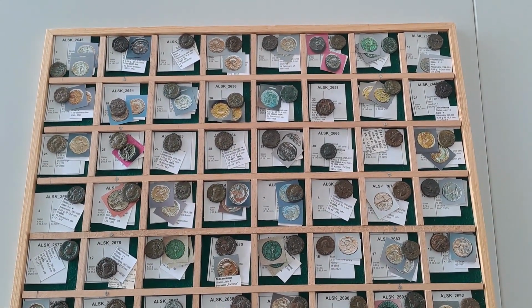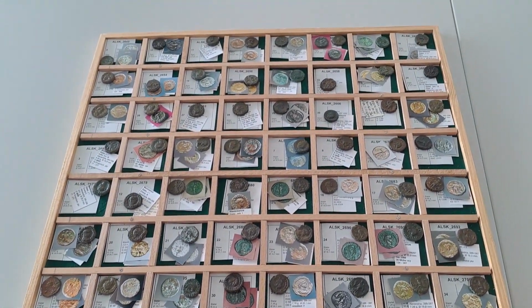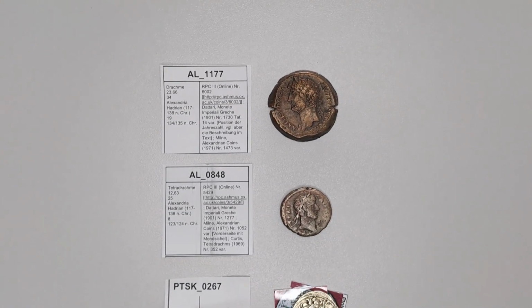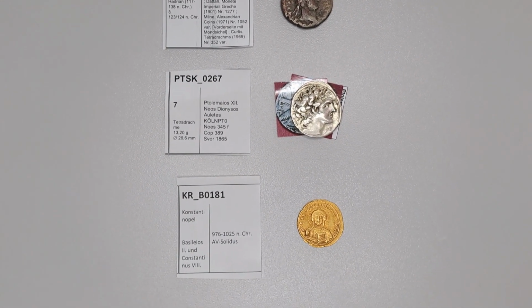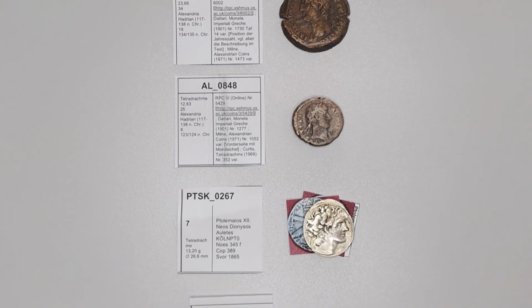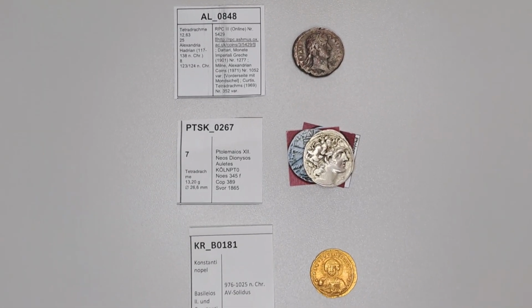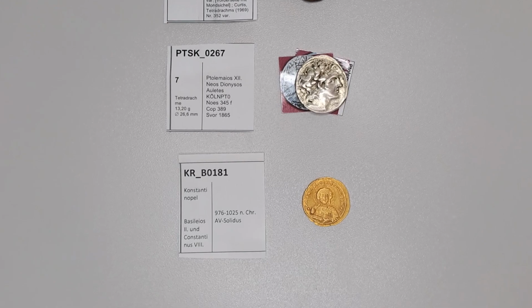And since we're now expert on the theory of X-ray fluorescence, we can sit back and watch the measurements of the coins. Which coins are being measured today? A drachma from Egypt dated to 135 AD, a tetradrachm also from 124 AD, another silver tetradrachm from the Ptolemaic times, much earlier from the 1st century BC. And of course, there are gold coins in this collection, including the one from Constantinople, dated to be between 976 and 1025 AD. I will go into more detail about these coins after the measurement.